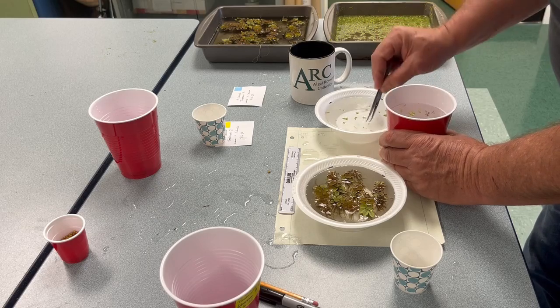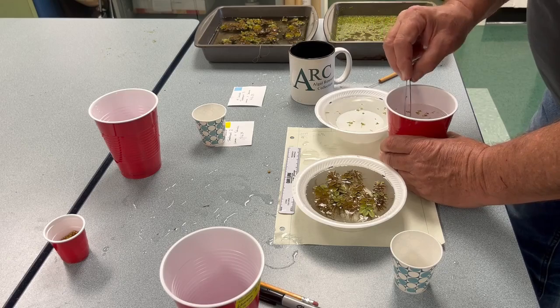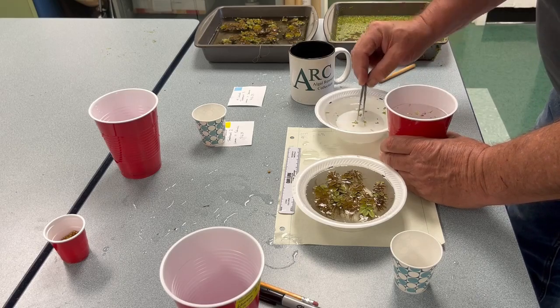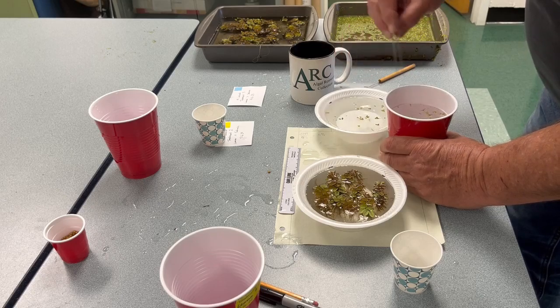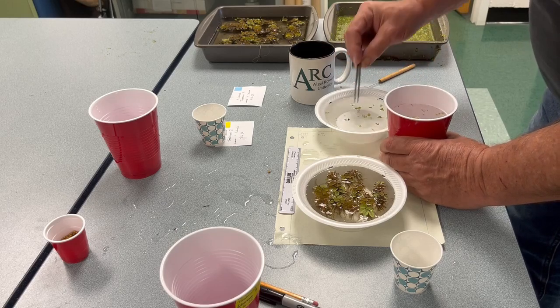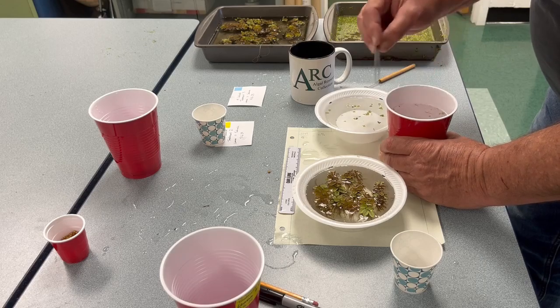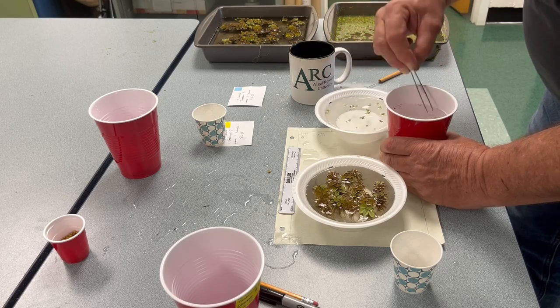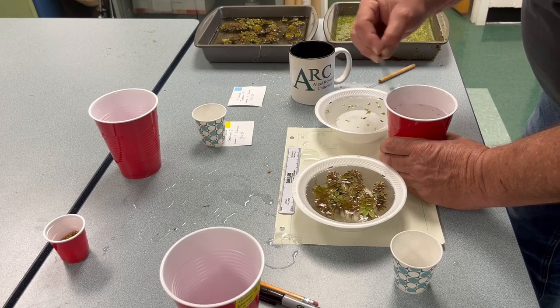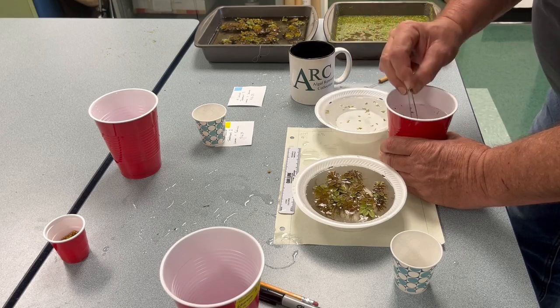Now keep in mind that we're already putting them in a pretty crowded situation, so we're not expecting huge amounts of growth, because it's hard for them to go much above 100%, and we're starting them at a total of 80%. What matters is which ones grow more and which ones might decrease in abundance.